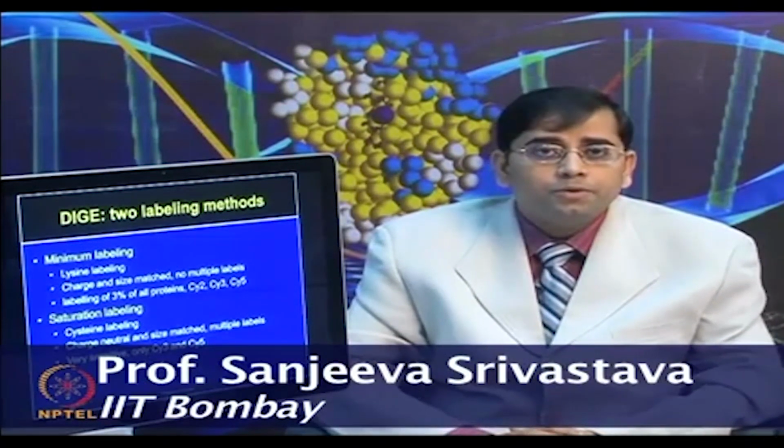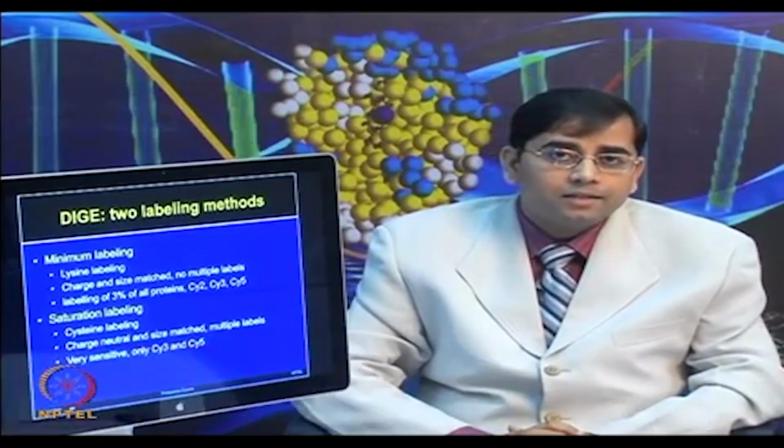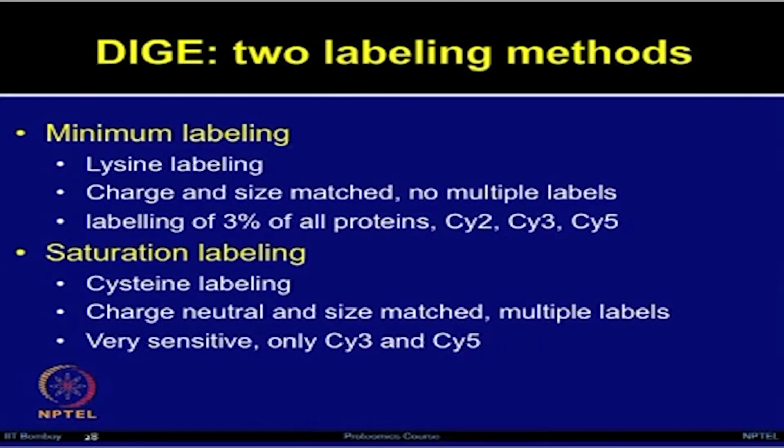Now, let us talk about the different types of labeling methods. In DIGE, there are 2 different types of labeling methods which are possible. One is the most commonly used, lysine labeling, and the other is cysteine labeling. The lysine labeling method, also known as the minimal labeling method, is where the charge and size of dyes are matched and there are no multiple labels. It is known as minimal labeling because it is only labeling 3% of all the proteins. I will give you the reason why that is.